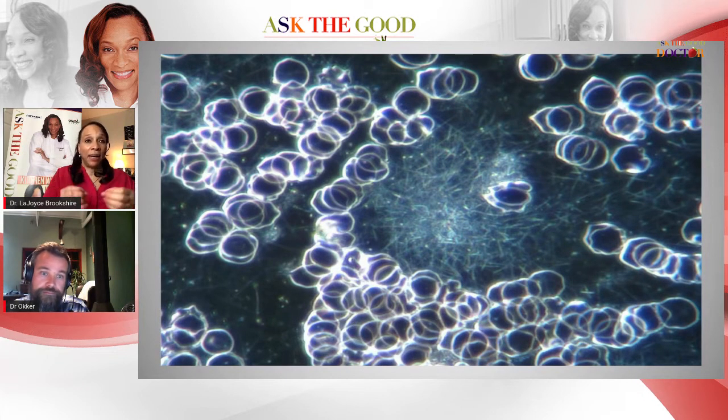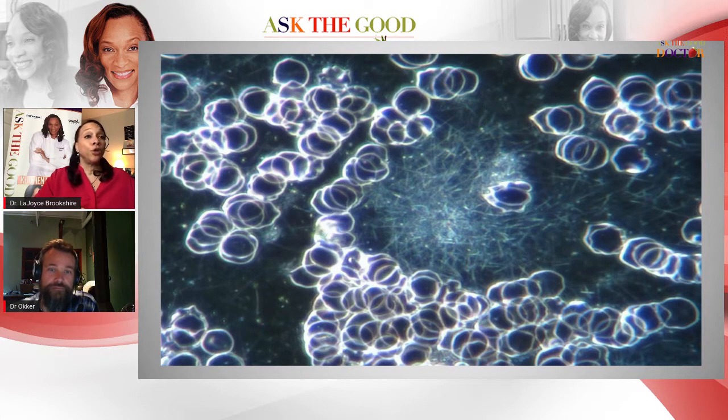And here's what I love about this. If you look at something just like this, and even if you don't know what you're looking at, you know it's trouble. Absolutely. Yes, you know it's trouble. You may not know what kind of trouble, but if this was your slide from your blood, if you were in the office of a practitioner offering live blood cell analysis, you would say, oh, because it should be floating free. And that's the point. You underscored every single thing I've been teaching here for a long time, and quite succinctly with this one slide.